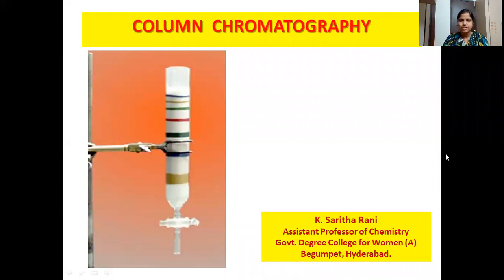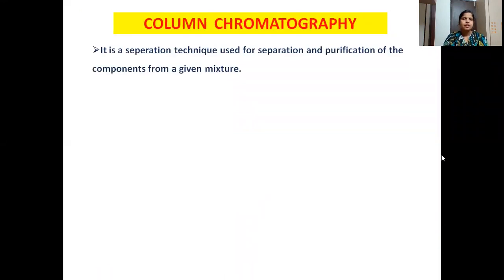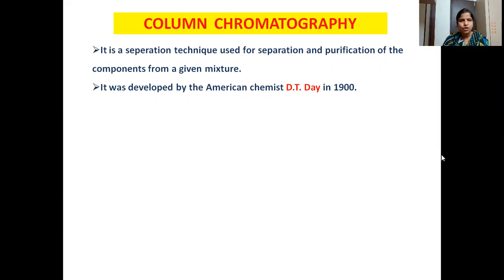Column chromatography was first introduced by the scientist D.T. Day in the year 1900. As in the case of all chromatography techniques, column chromatography is used for the separation and purification of the components from a mixture.